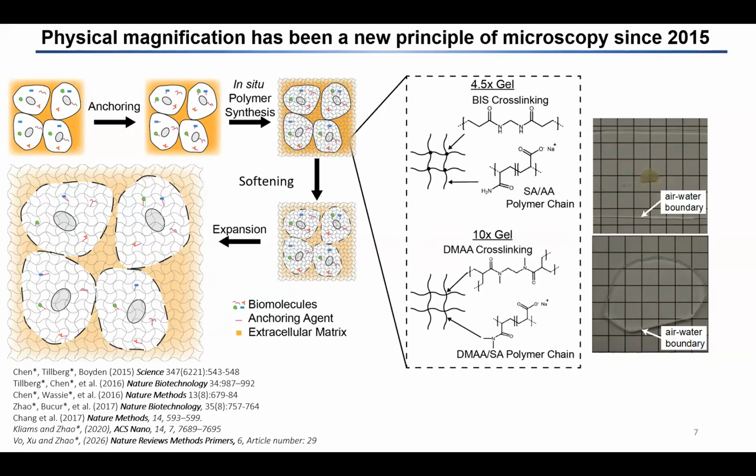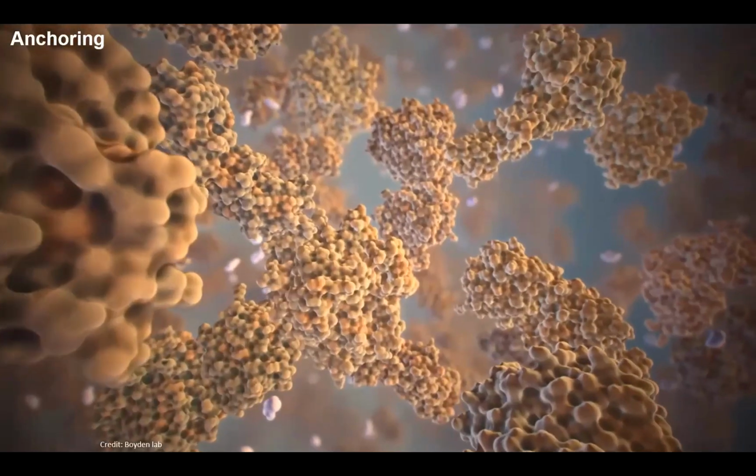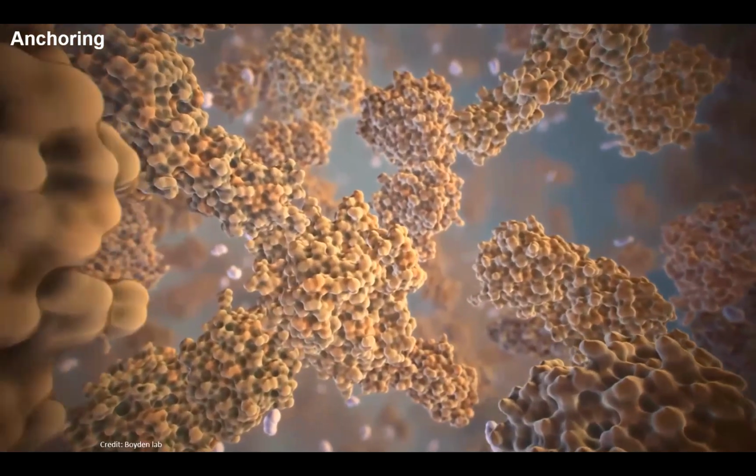That allows the sample to expand in the water. There are a bunch of review articles showing this, and we recently also published one of the most recent ones in Nature Reviews Methods Primers. If you're interested, you can look it up. So here, I just want to show you one animation, to give you a concrete idea, right?